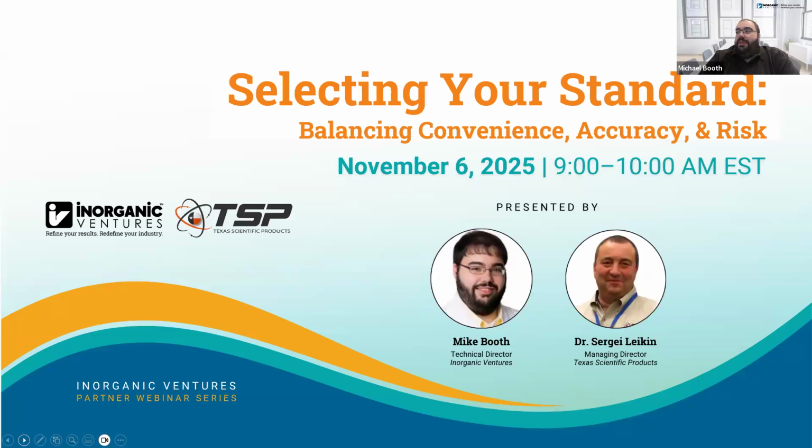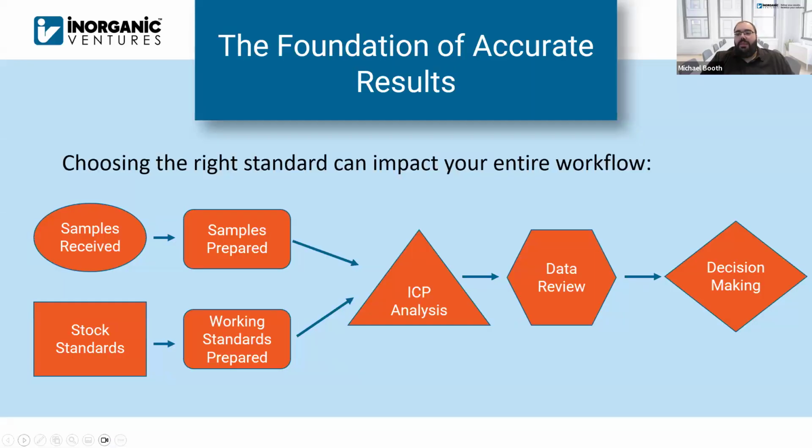Please keep that up. All right, so why is selecting the right standard so critical? It's basically because it's the foundation of your whole analysis. You have all of these things that impact the accuracy of your results, and a big part of that is the standards. If you choose the right standards, it can also have an impact on your sample preparation.